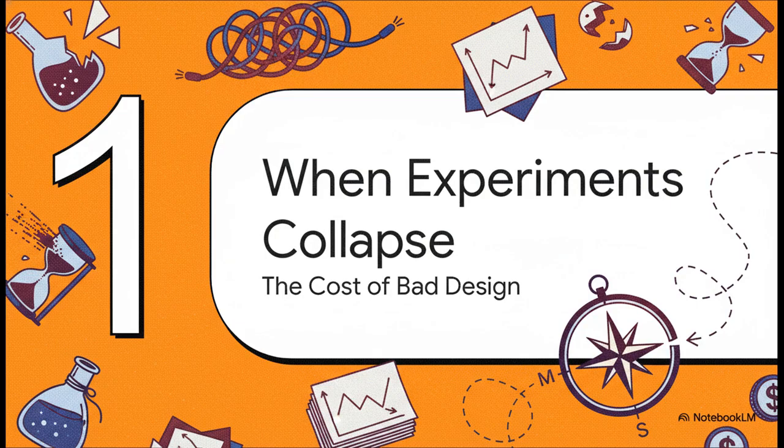So, what's the big deal if the design is bad? Well, you get what I call an experimental collapse. And it's so much more than just getting a wrong answer. It's wasted time, it's squandered funding, and it creates these misleading results that can literally send an entire field of research down the completely wrong path for years.